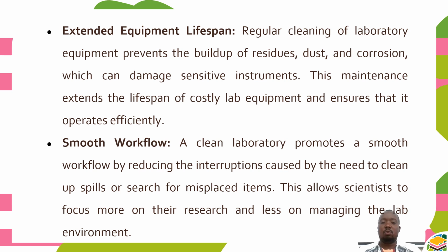Then there is smooth workflow. A clean laboratory promotes a smooth workflow by reducing interruptions caused by the need to clean up spills or search for misplaced items. This allows scientists to focus more on their research and less on managing the lab environment.